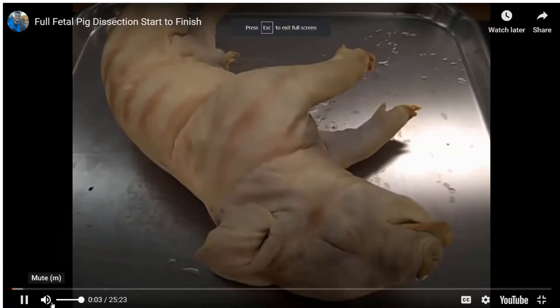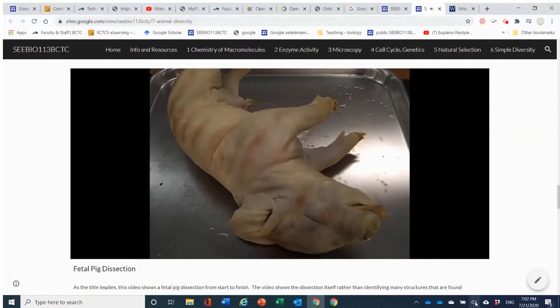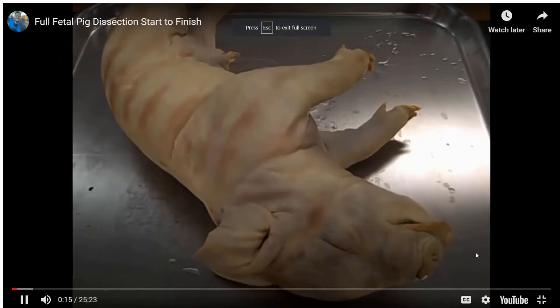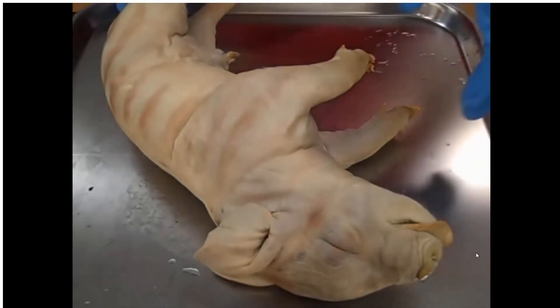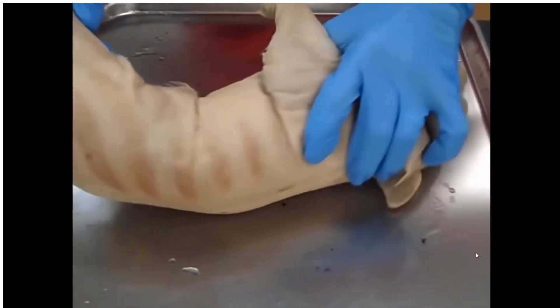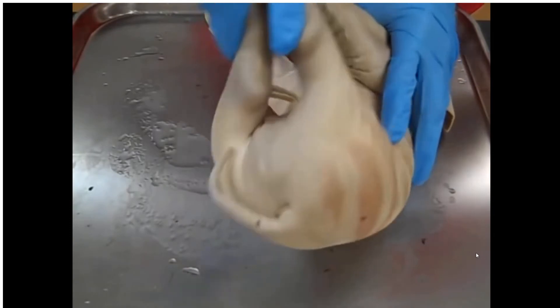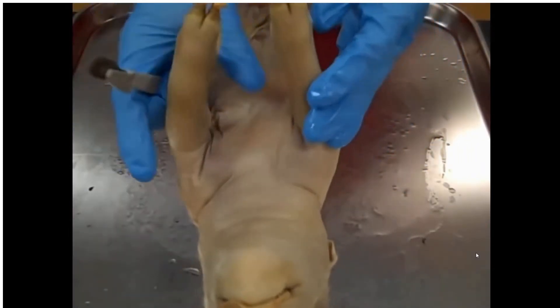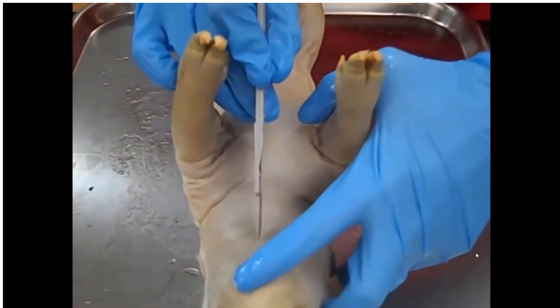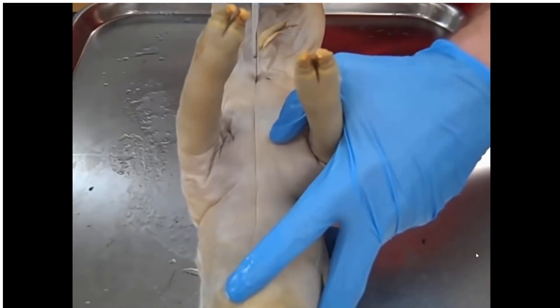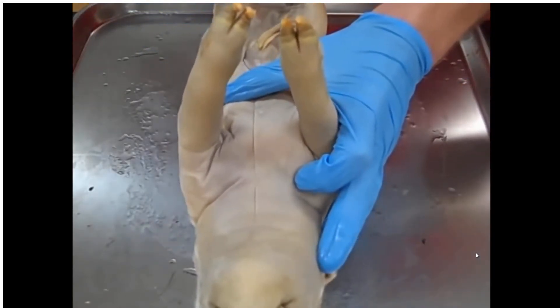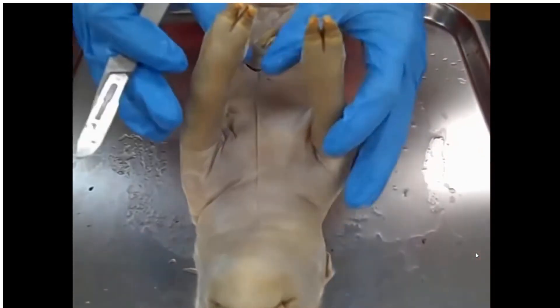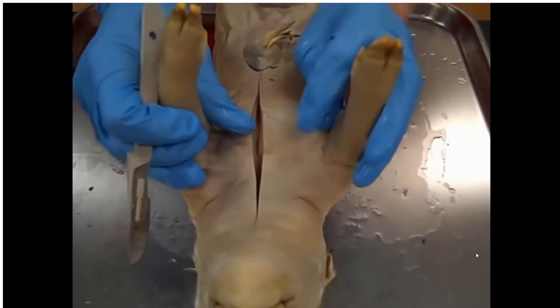Thanks for joining me for this fetal pig dissection. The first little bit is going to be making our incisions, and then once we're done opening up the body cavities, we will go through all of the structures that you need to know. First things first, let's go ahead and identify the sex of our pig. Based on the testes protruding from the back, I know this is definitely a male. To begin our dissection, we're going to need a scalpel — nice and sharp. We're going to need to go through many layers of tissue, including epithelial tissue, connective tissue, and also muscle.